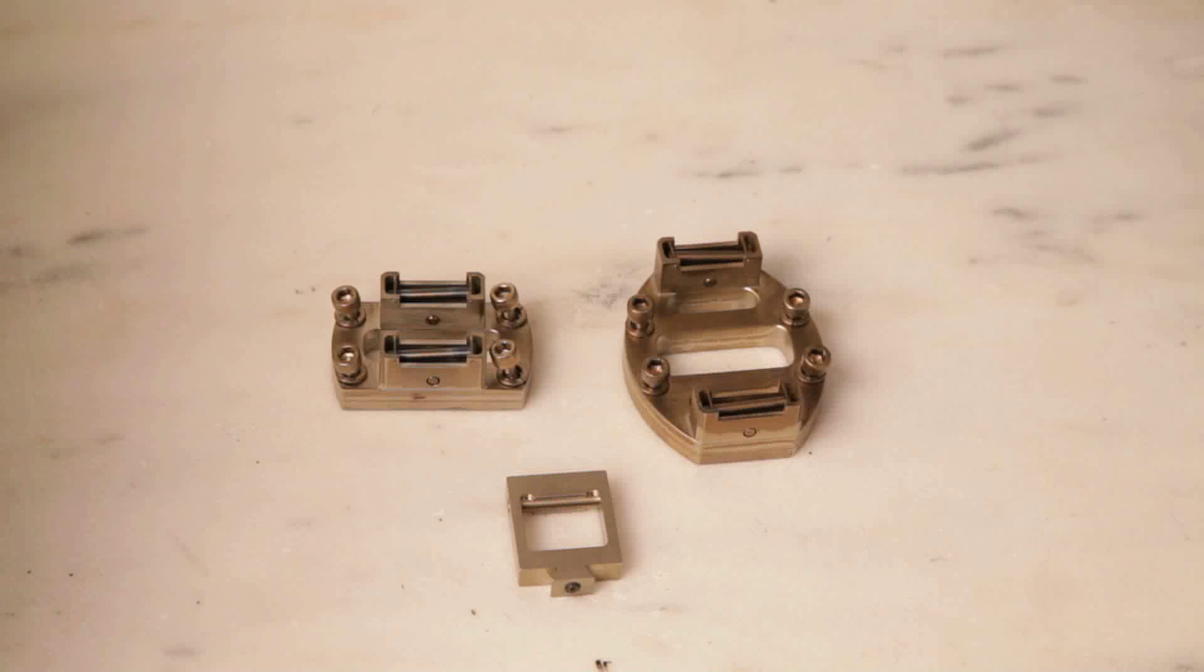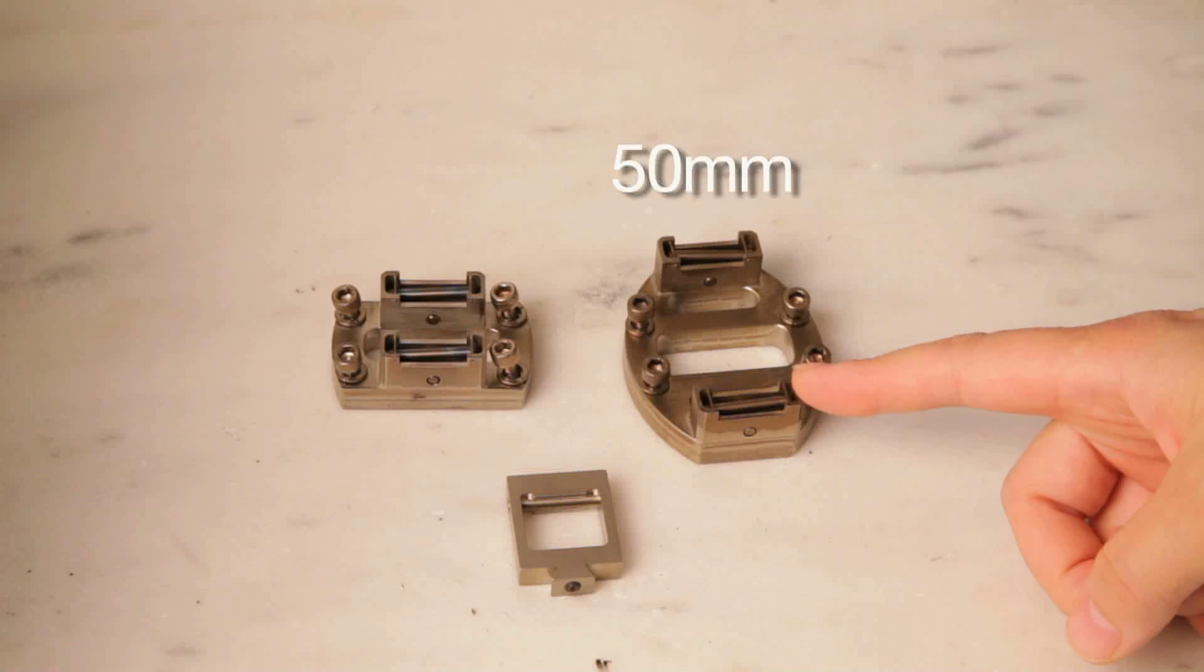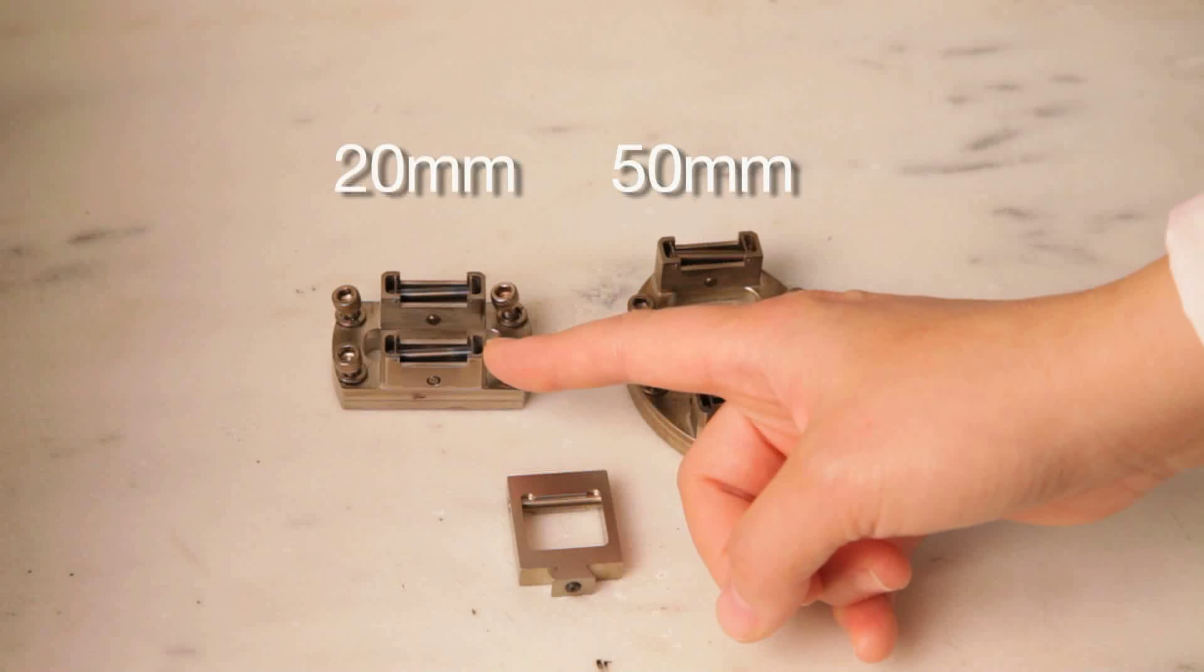This TA Tech Tip is going to show you how to calibrate the Q800 Low Friction 3-Point Bending Clamp. TA Instruments offers two sizes of low friction 3-Point Bending Clamps: 50mm and 20mm.